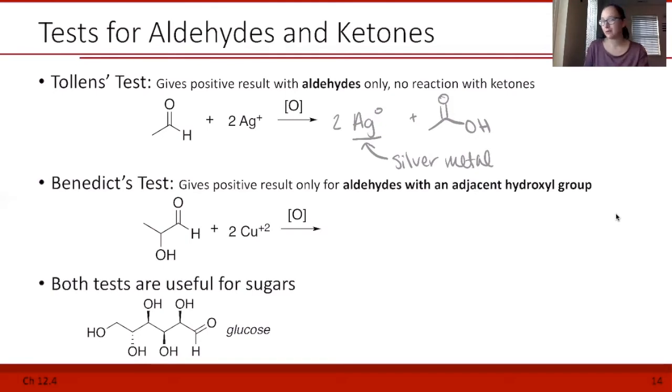So if it's like an olden mirror and has actual silver, they take a piece of glass and then put a solution of silver plus and an aldehyde on top of it, and after the oxidation goes, they let the silver line and make a super thin layer of silver on that glass, and that's a metallic or a mirror surface. So this is also called the mirror test. A different test that we could do is Benedict's test.